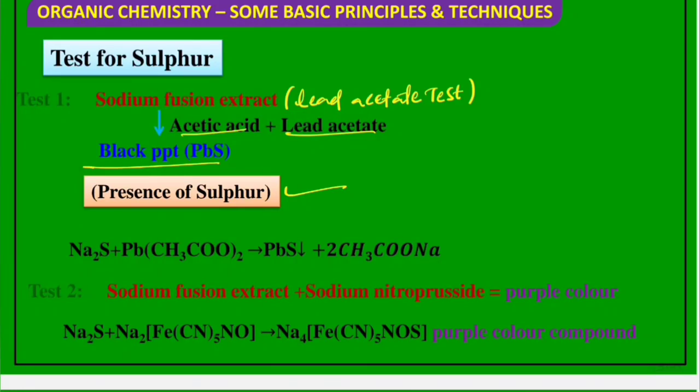The black precipitate of lead sulfide confirms the presence of sulfur.